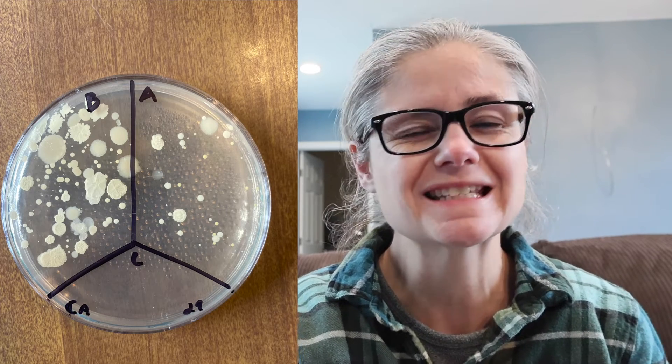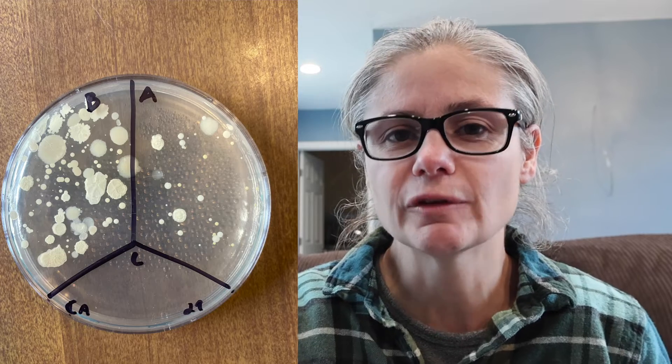The arm of the couch — in the before section we can see a lot of bacteria. That's actually a nice sampling of bacteria. And in the after section we can see a slight decrease in the amount of bacteria, but not a huge decrease. So in my opinion the Tide Antibacterial Fabric Spray does an okay to not-so-great job at removing bacteria from my couch arm.